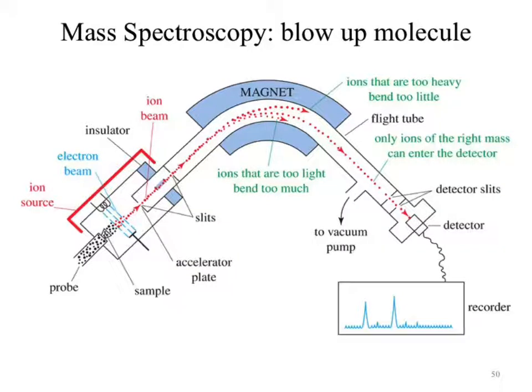Okay. So, mass spec. What is mass spec? Blow it up. That is literally what we're doing with mass spec. We take our molecule, we go, I don't like you, organic chemistry, die. And it blows apart. We then evaluate all those pieces. So those of you interested in forensic science, and in how you could evaluate the different pieces of a crime scene and put those back together to draw a conclusion, that is mass spec. Except on a really tiny scale.